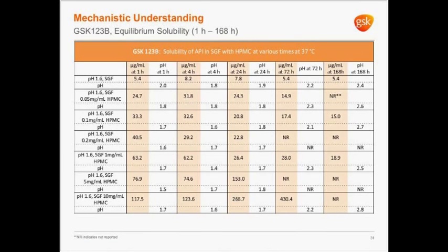Some of the 72-hour and 168-hour data points could not be collected, unfortunately, due to the fact that the sample vials dried up and we just didn't have any material to test. And that's really because of the elevated temperatures that we were running these experiments at.